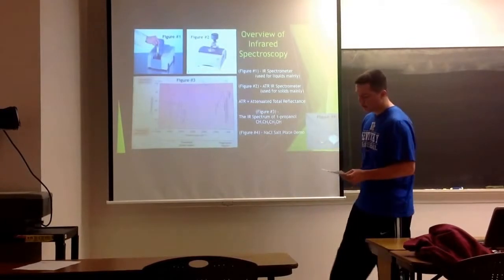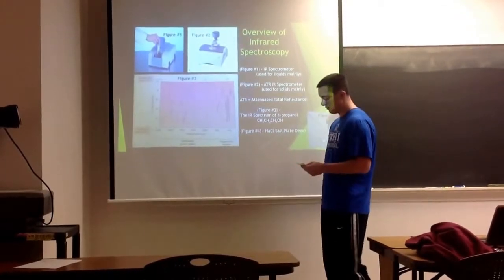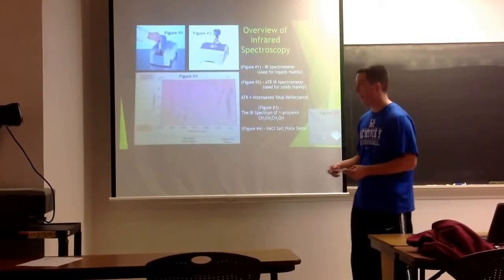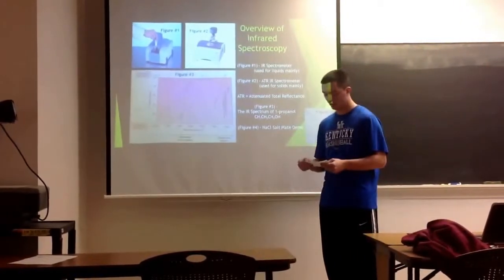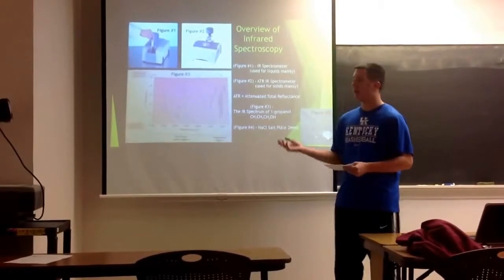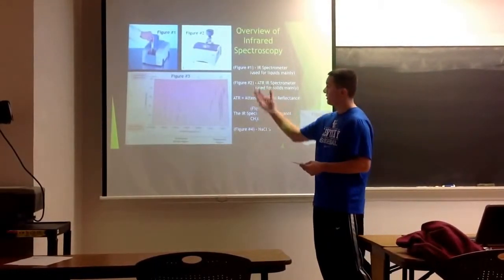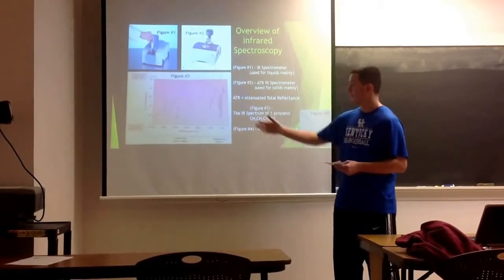Infrared spectroscopy is the spectroscopy that deals with the infrared region of the electromagnetic spectrum. It helps us to identify certain functional groups. For any given sample, which can be a solid, liquid, or gas, we use the infrared spectrometer to produce this spectrum right here.